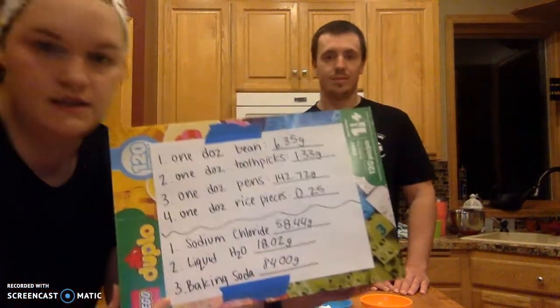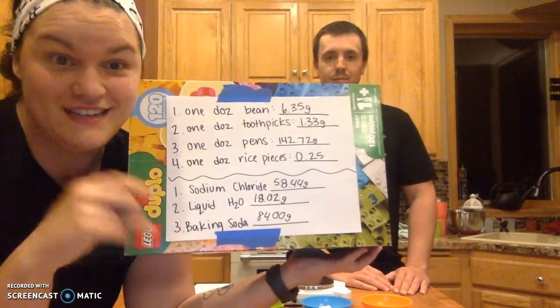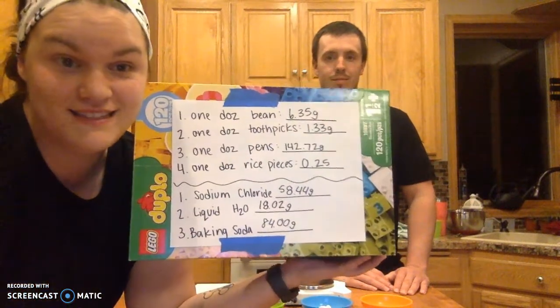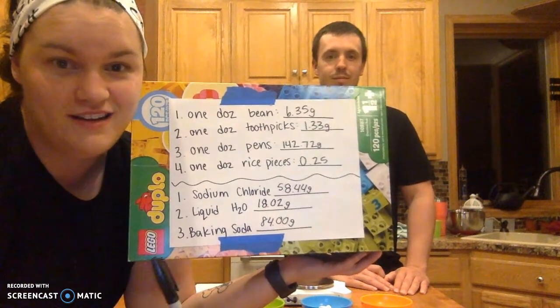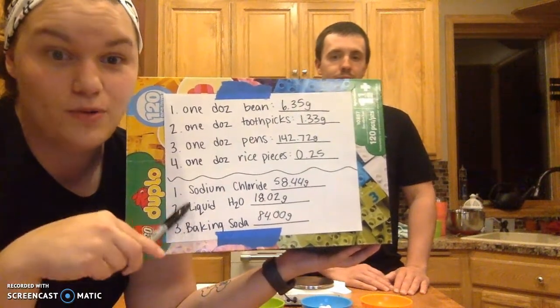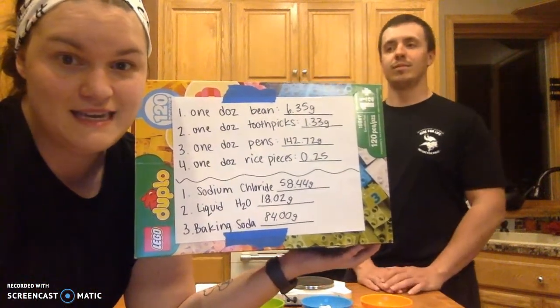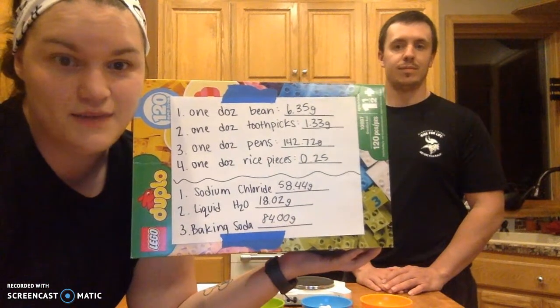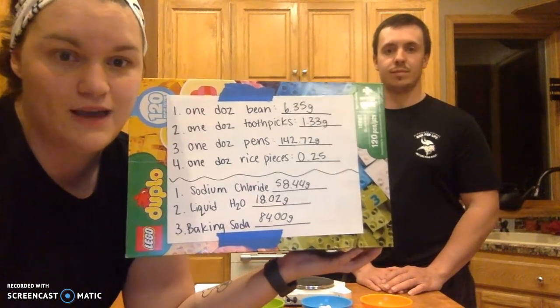Okay, so what we can see here, now those are obviously different masses. Now they probably have some sort of significance. And what that significance is, I want you to go take a look. Go use that Google machine and look up the molar mass of each of these things. Okay, what you should see is that each of these masses is equal to 1 mole of that substance. Okay, it's the molar mass.